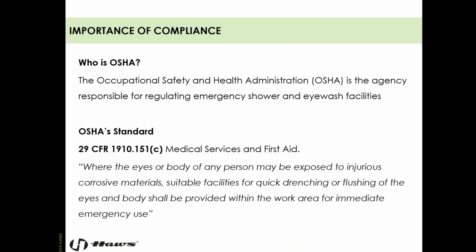All right, moving on. So step one, the importance of compliance. I'm sure probably all of you know who OSHA is, but just in case you're learning, educating yourself, and getting up to speed, OSHA is the Occupational Safety and Health Administration. They are the agency responsible for regulating emergency shower and eyewash facilities, and for holding us all accountable and making sure that we are maintaining standards that are acceptable for our employees, right?